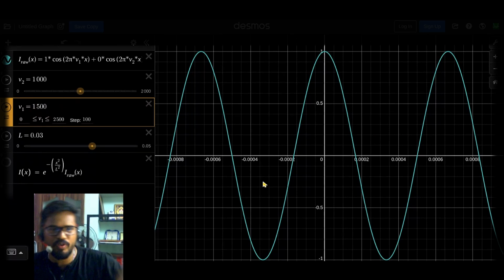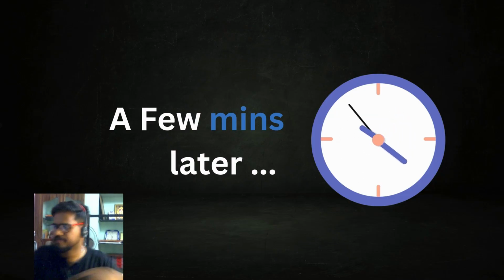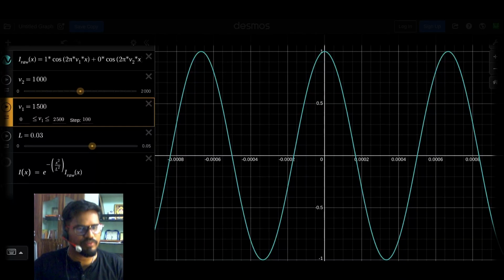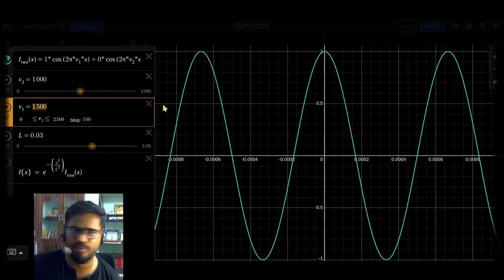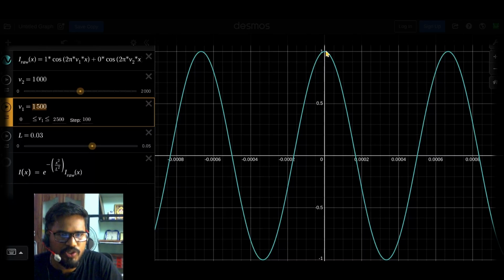Hey, how would the spectrum of this look? If we take Fourier transform of this, how would it look? Fourier transform gives you a frequency content. In this case, there is only one frequency, say 1500 centimeter inverse. So how should the Fourier transform look? There will be a spike at 1500. The Fourier transform will be zero everywhere except at one wave number, 1500 centimeter inverse. There will be one spike that corresponds to this amplitude 1.